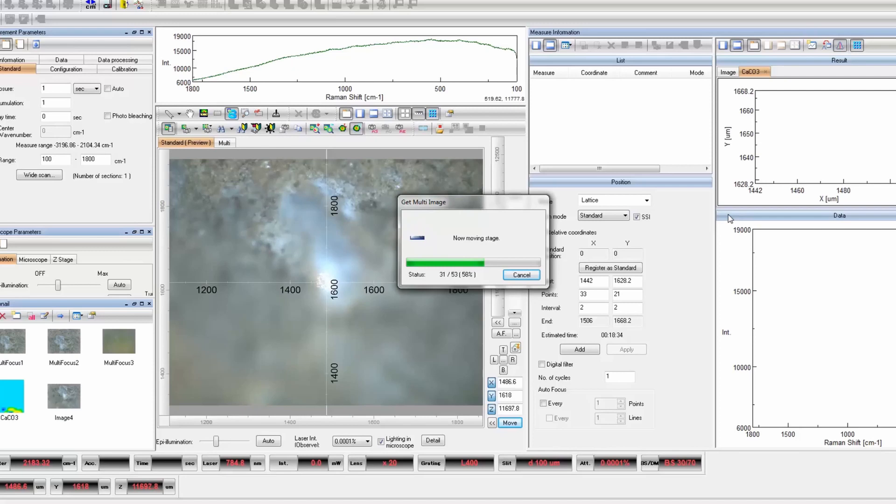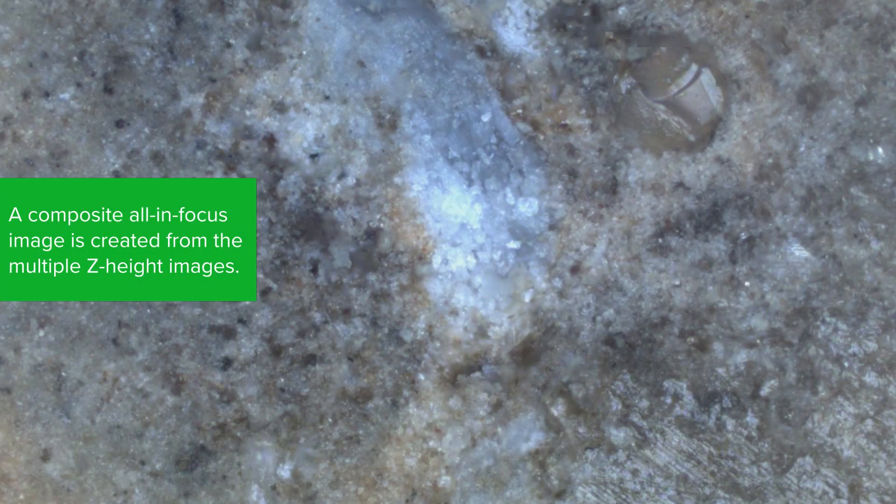Once an image has been acquired at each focal point through the sample, they're brought together to synthesize an in-focus image for the entire sample.